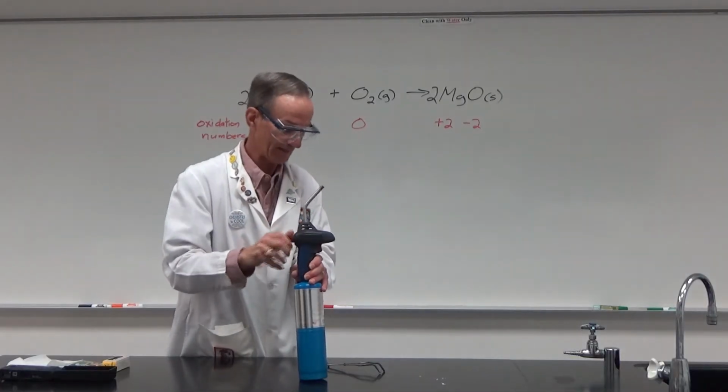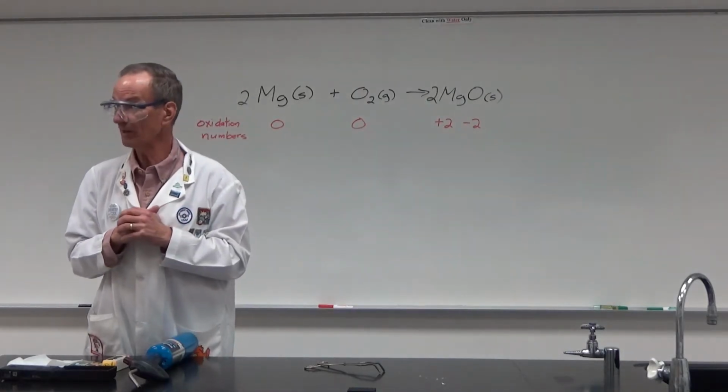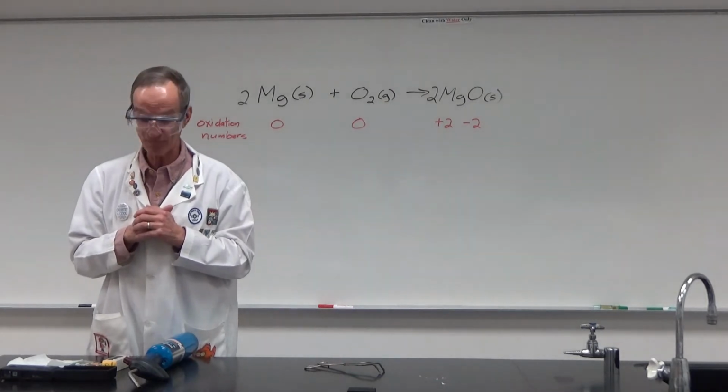And if we could look at the camera onto the desktop right here, we can see that what's left, there are little bits of magnesium ribbon, but mostly a white powder. And the white powder is the magnesium oxide. Now, many years ago, this brightness from this flame was used to a really great advantage by improving photography.